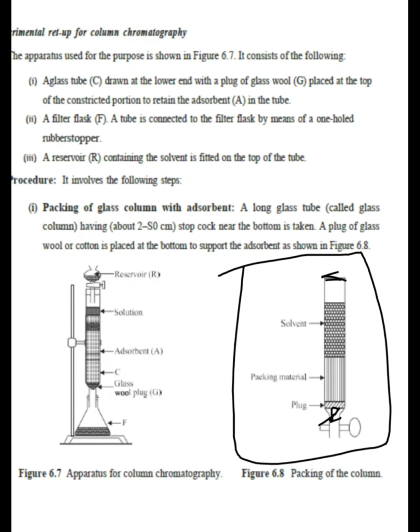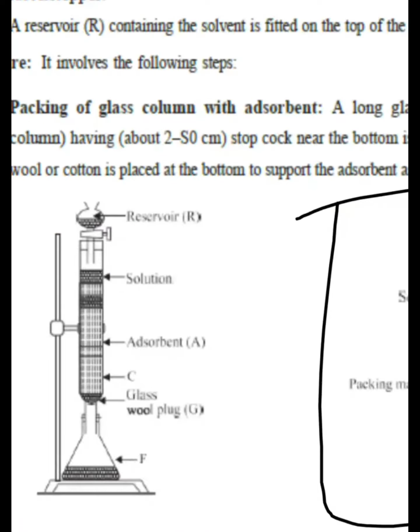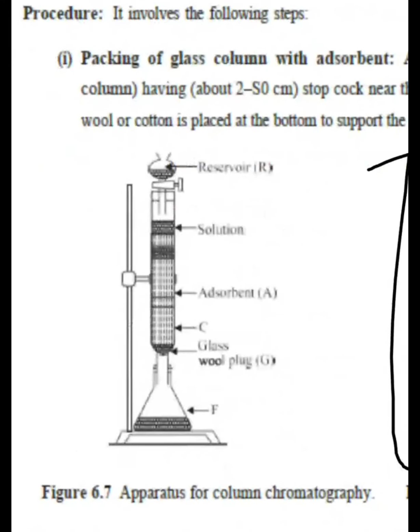Further, we use the packing material, which is the stationary phase. The stationary phase is the adsorbent, meaning we use silica gel, alumina, or other adsorbents.